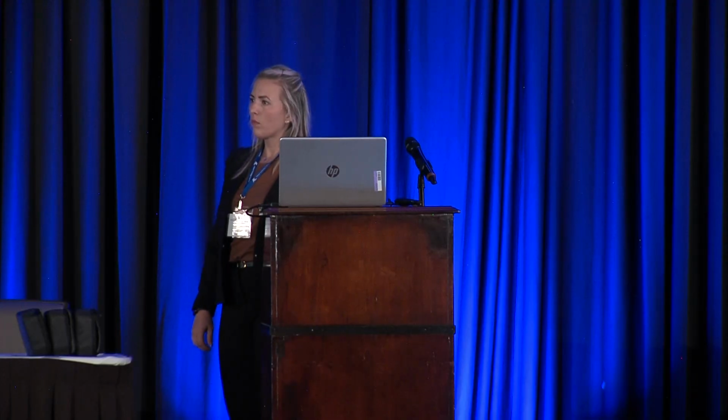Hi, Elena, great talk. So in the first part of your presentation, you shared the raw material library qualification. How does your software handle completely new or foreign raw materials that are not contained in the library? Do you get a non-match, or does it just give you a prediction of what is the closest raw material to the new material? So if it is not in the library, it will be seen as an unknown. It doesn't give you a pass or a fail, it just will indicate it's not in the library, and you can program all kinds of alerts into the software.